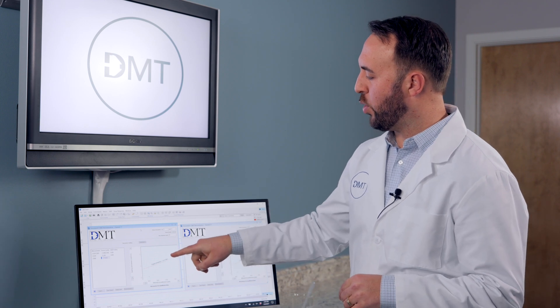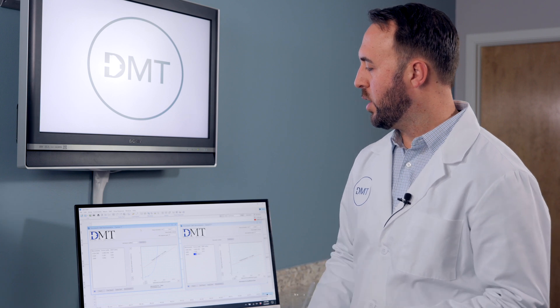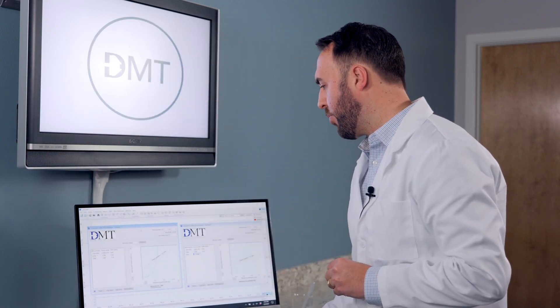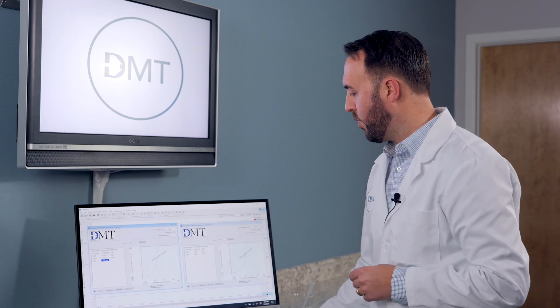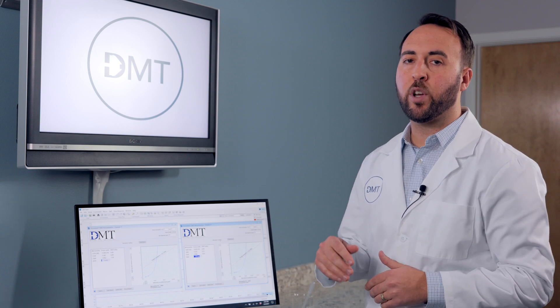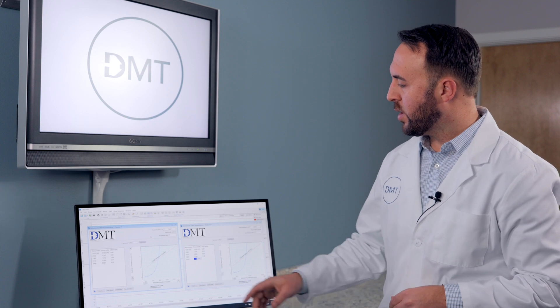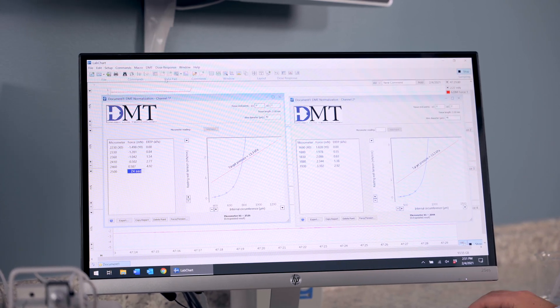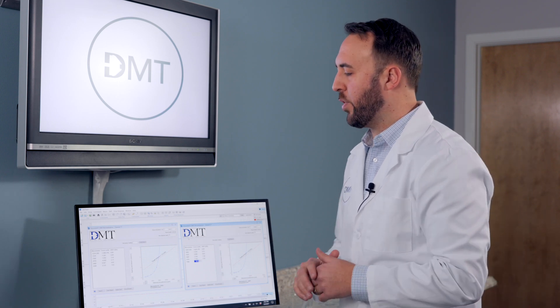What we are trying to do is just get over the target pressure line, which means we have reached the target pressure point and will give us our maximal responses. We still have a ways to go, so I will add more to channel 1 — in this case, 50 microns — and the same with channel 2. You will repeat this until you reach your target pressure line. You don't want to go too far over that line if possible; do your best to just go just over the top. You need a minimum of 4 points for an accurate reading, but typically you'll end up with somewhere between 6 and 10 points.